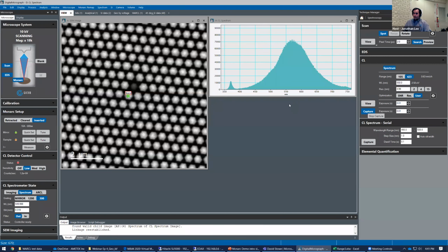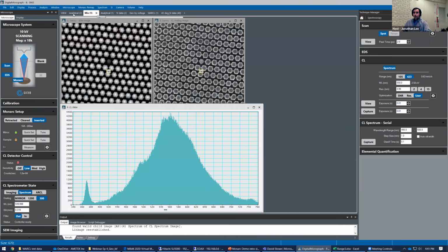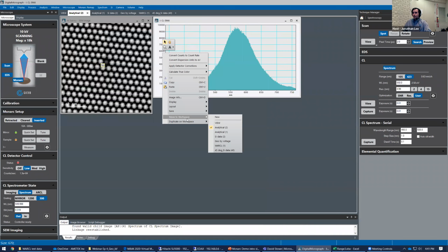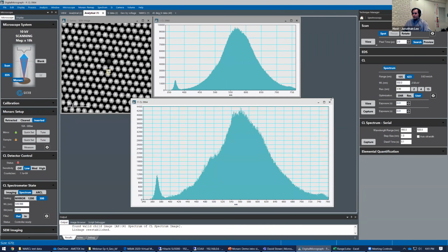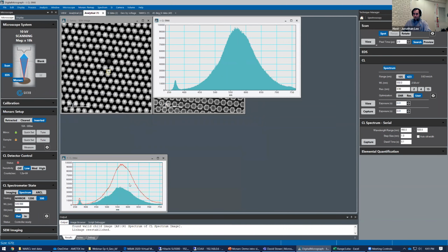And then we'll capture this spectrum, which is populated on analytical 2. And we'll just move that over to analytical 1. So this is the first spectrum that we captured. We moved up 100 micron, and now the intensity is something like double.